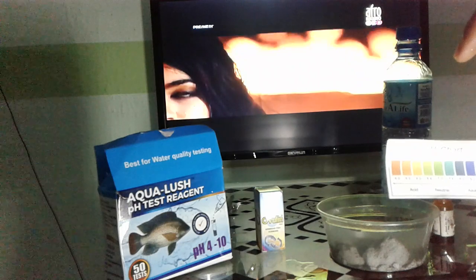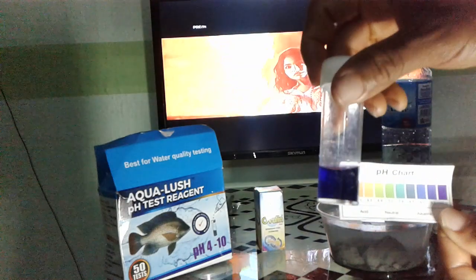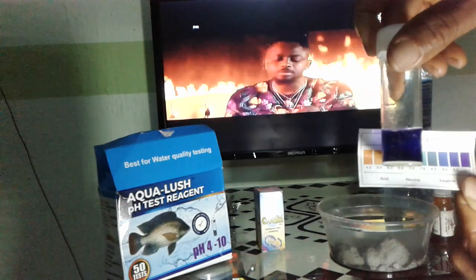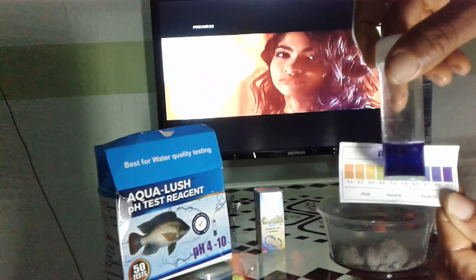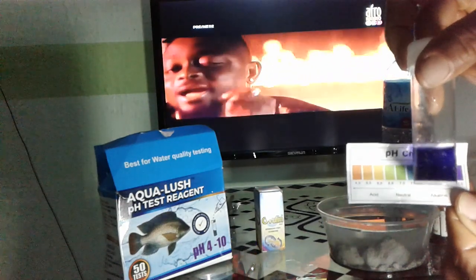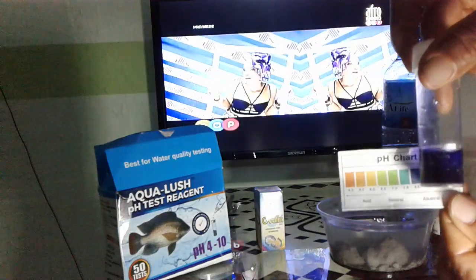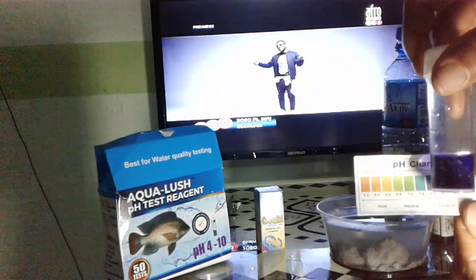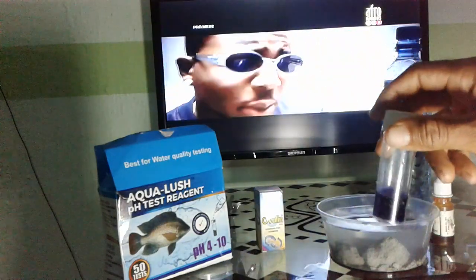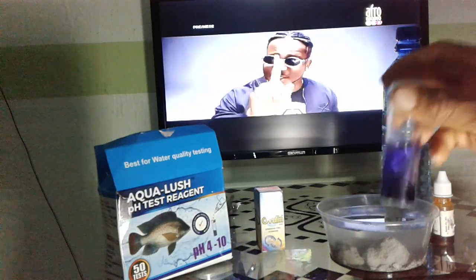We're now going to place this sample on the chart. Starting from here, you can see it's not acidic. Coming down, the water is not neutral. It's not pH 8.5, not pH 9, not pH 9.5 — and getting here, you notice that this water is pH 10. That is the nature of the water in your newly constructed pond, which is not good for your fish.